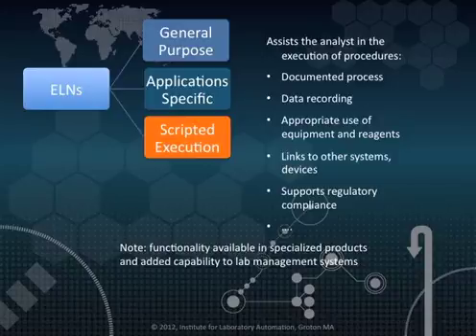In most regulated environments, equipment used for testing has to be periodically calibrated and evaluated to make sure that it's working properly. In addition, chemical solutions that can age and change their properties have to be periodically evaluated to make sure that they are suitable for use in an analysis or procedure. These electronic systems keep track of equipment calibration and reagent characteristics to make sure they're suitable for use, avoiding having a technician running a test with equipment that is not in good working order or chemicals that are out of date. In those cases, the results wouldn't stand up to challenges and could jeopardize a research project.